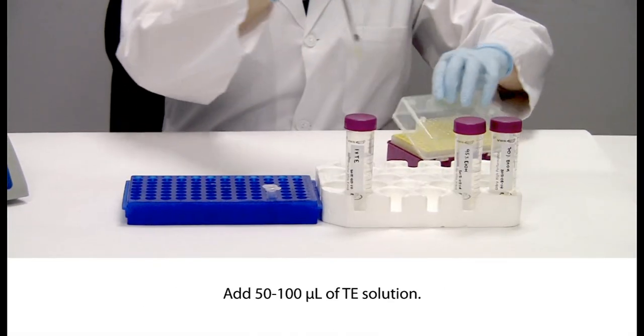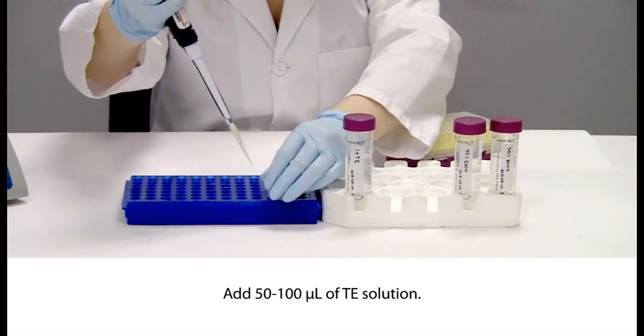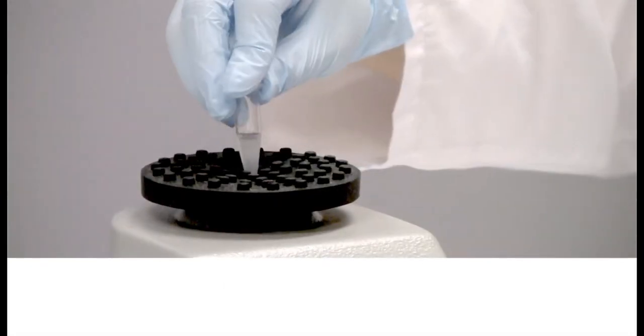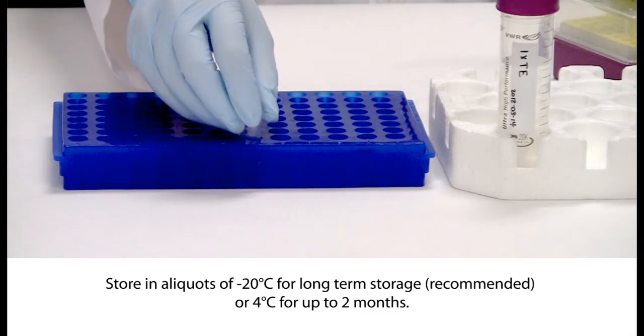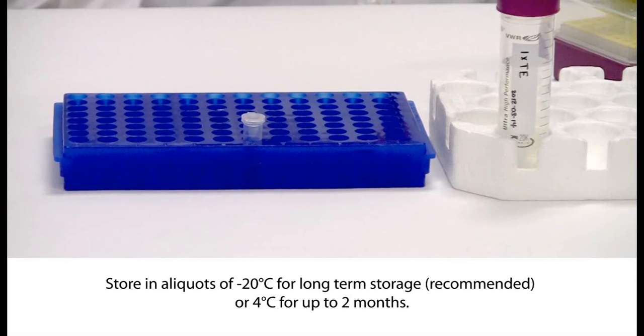Add 100 microliters of TE solution and vortex the sample for at least 5 seconds. If a higher concentration of DNA is desired, 50 microliters of TE should be used. Incubate overnight at room temperature or at 50 degrees Celsius for 1 hour, vortexing occasionally. Incomplete rehydration of the DNA is a cause of inaccuracy in estimating DNA concentration and potential failure of downstream applications such as PCR. Store in aliquots at minus 20 degrees Celsius for long-term storage (recommended), or at 4 degrees Celsius for up to 2 months.